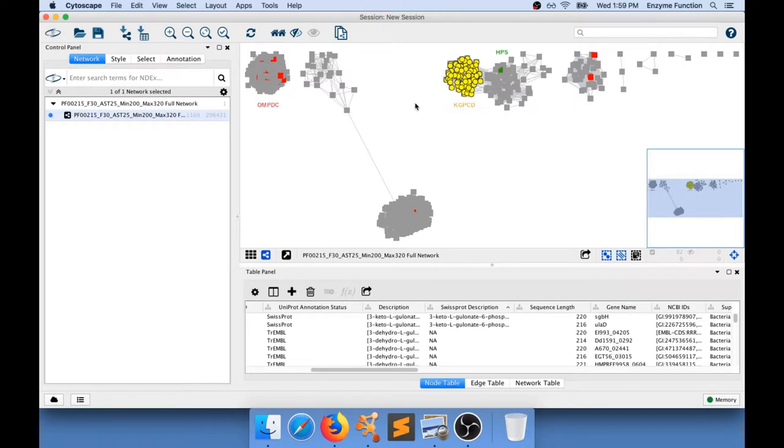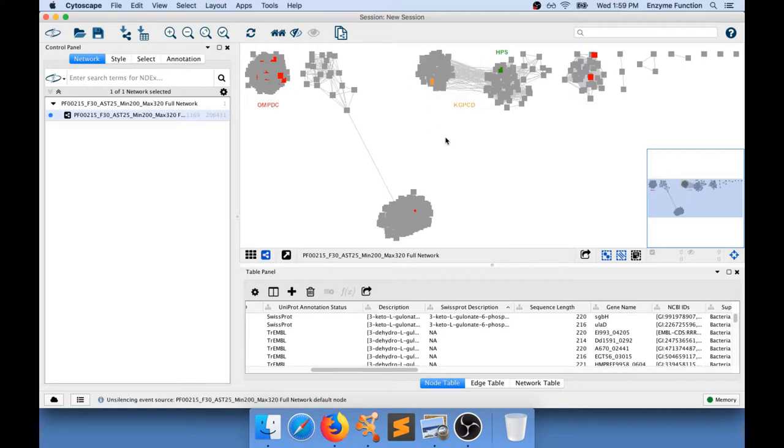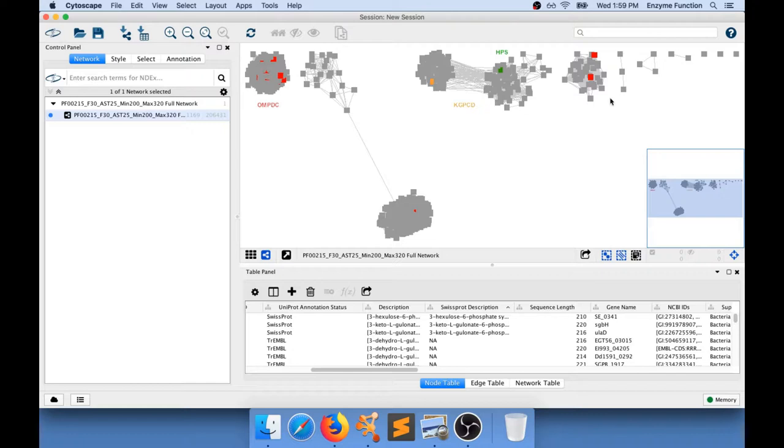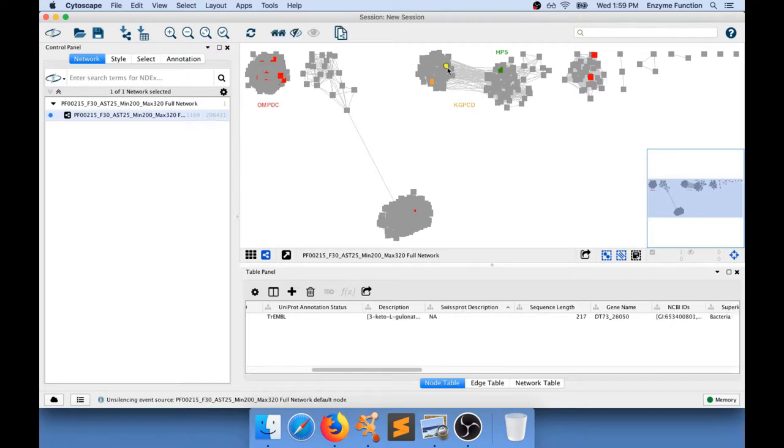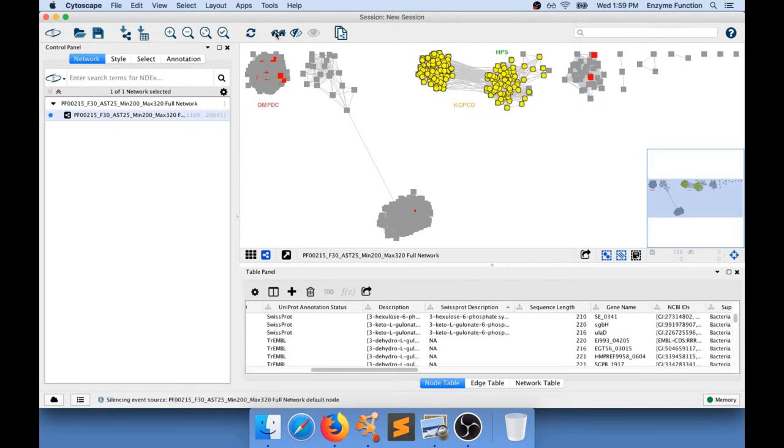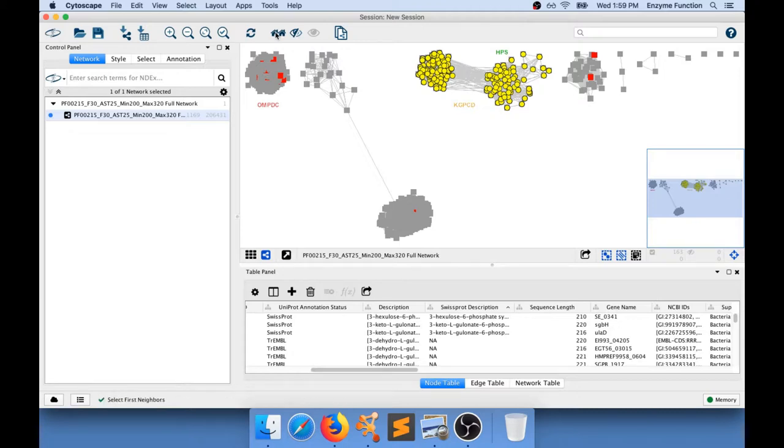What I want to do next is actually move that a little bit further away so I can examine that. Because this is not very well defined let's do something. Let's select all the sequences in that particular cluster by selecting several times all the connected sequences and at some point you're not selecting anything anymore.